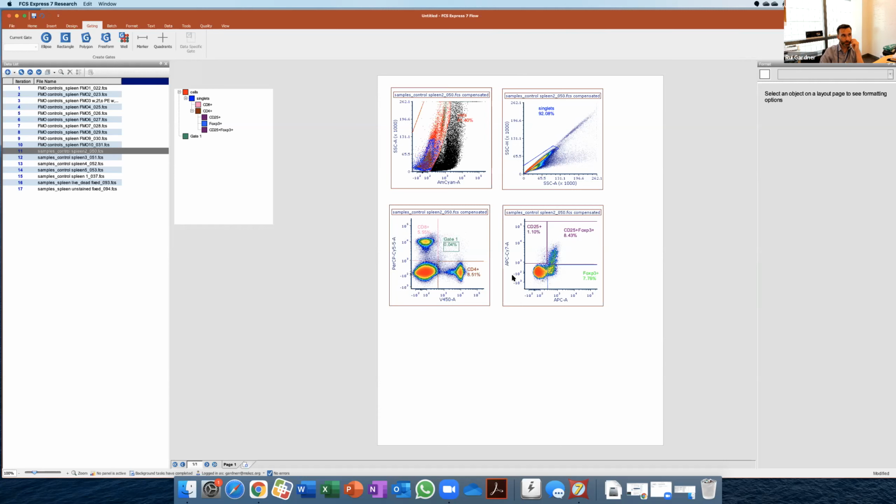And again, I go back to the clinical samples. When you're dealing with an outbred population like humans, you're going to expect a lot of variability. So maybe in the first experiment, things work very well and you don't need that FMO control. But in the second experiment, where you're looking at other patients, you may realize that you need it. Or your fluorochromes, your tandem dyes, may start degrading, and suddenly an FMO control that wasn't important can become important. So I would be very careful in dropping those FMOs unless you're really confident that you won't need them. Be vigilant. Keep watching the skies. Exactly.